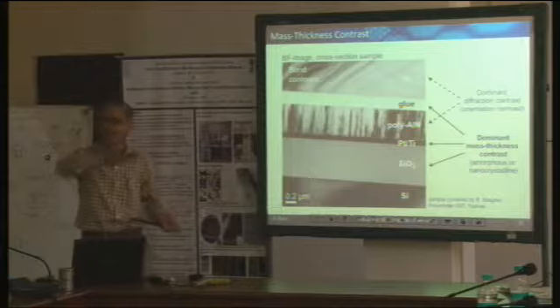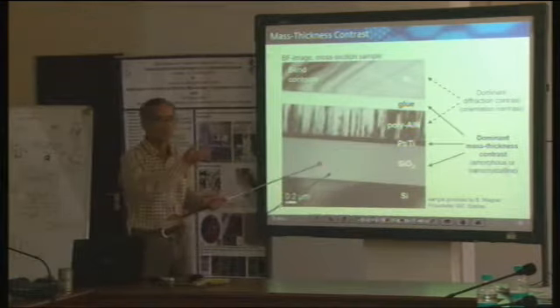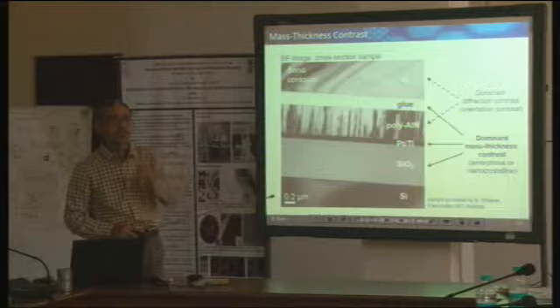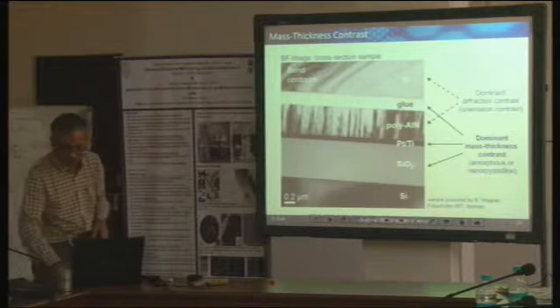One is oriented like this, another is oriented like this, and I am immediately seeing this in the contrast in the images. And you know, the misorientation between maybe this and this need not be very much, it may be very small. Usually it is probably not so much, maybe 2 degrees, 3 degrees, etc. But still I am able to see this contrast. Why? Such kind of things we will try to understand.